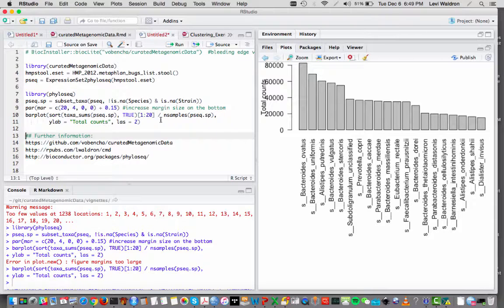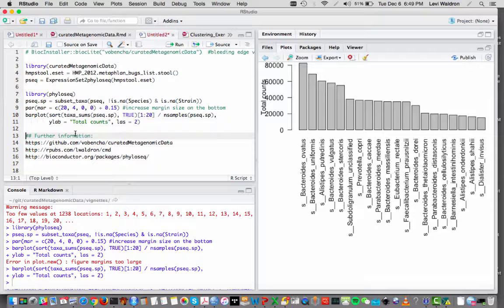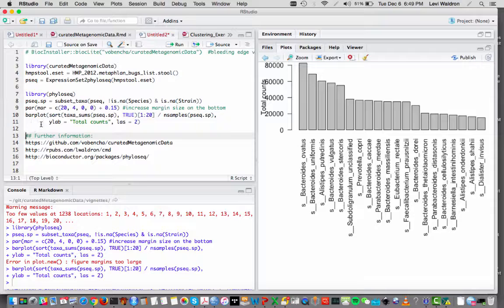A bar plot of the 10 most abundant, or sorry, the 20 most abundant species. So I recommend that you take a look at the phyloseq package. It has lots of stuff available.